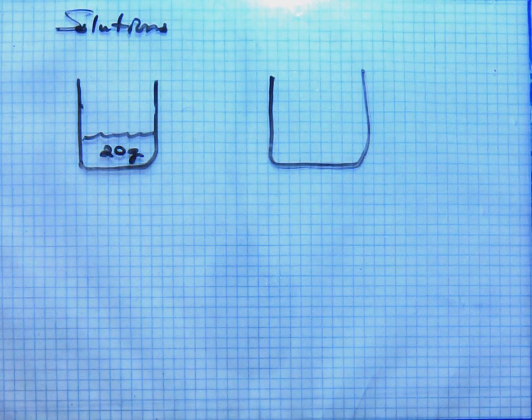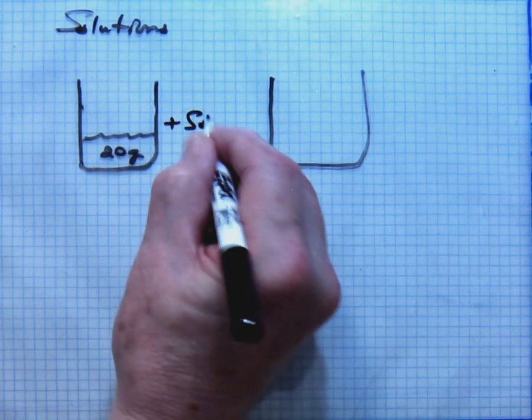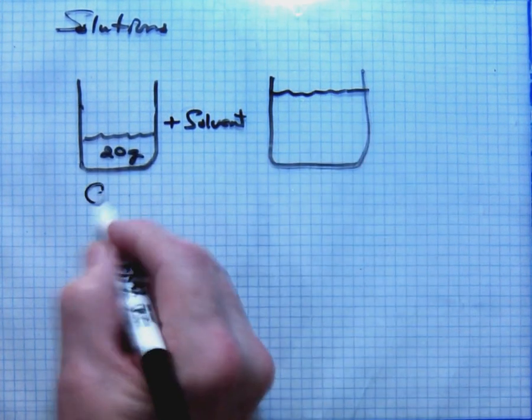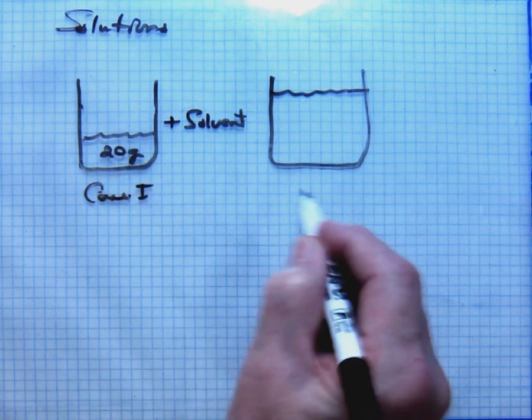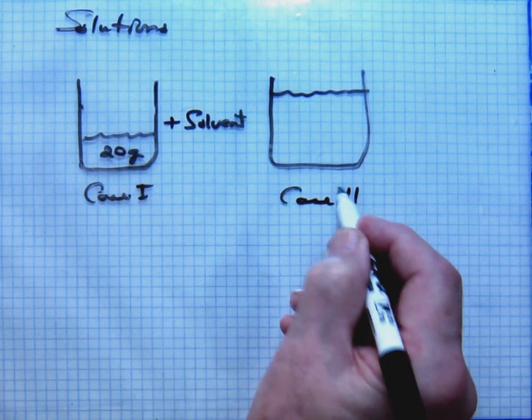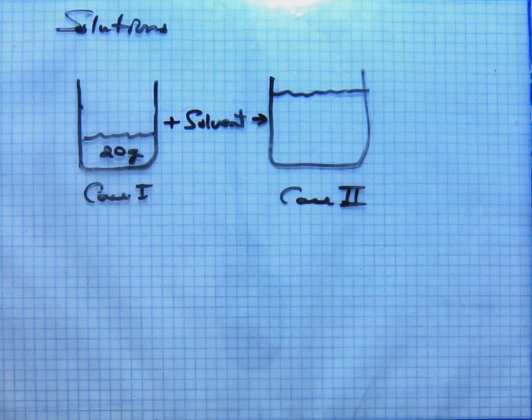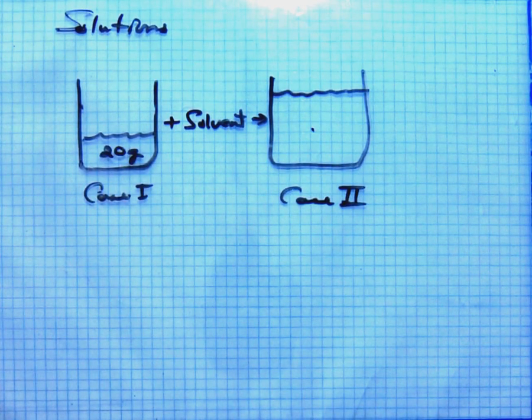Then I'm going to add solvent up to this point. Case 1, case 2. And so now we've got a solution, case 2, that still has X in it.